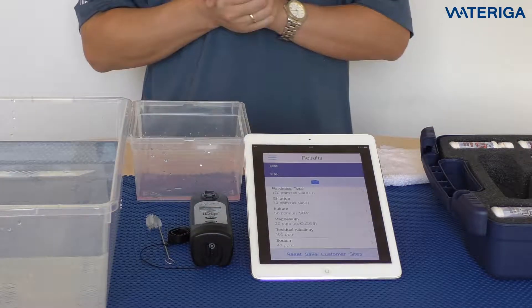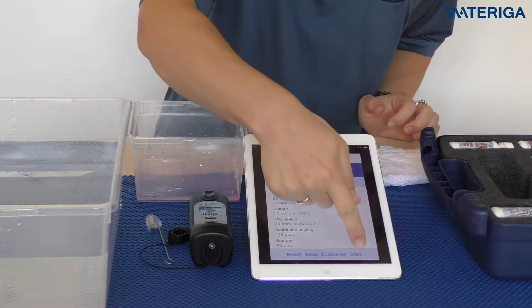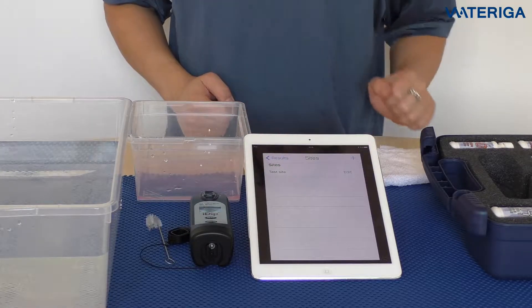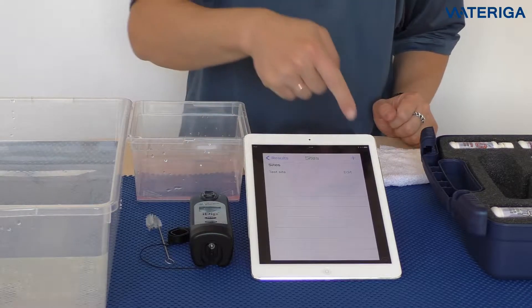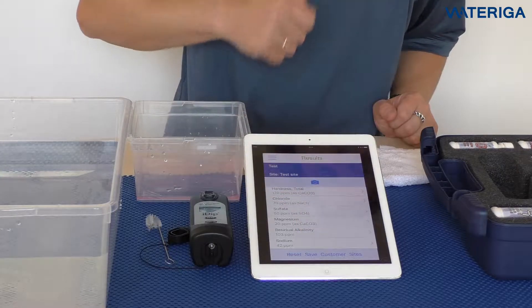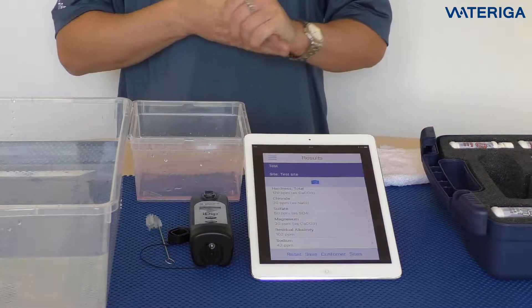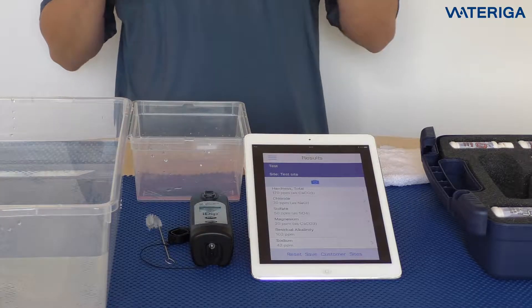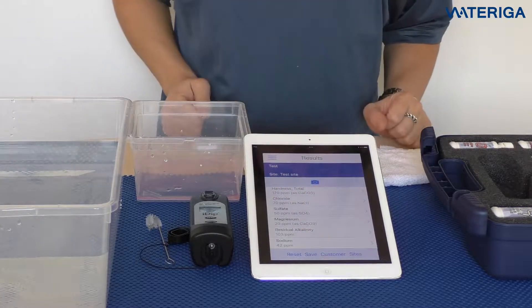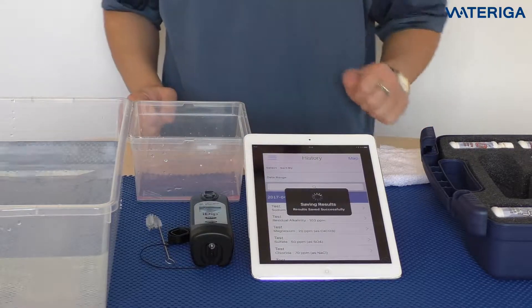In order to save these results, it's important to choose a site as well. We're going to choose site, and we've added a test site here. You can add any new site at the top. We're going to choose test site, then hit save. Once we hit save, the app will add a timestamp and also a GPS stamp. I would strongly recommend always saving the results as a whole test session like this. They now go into the history.